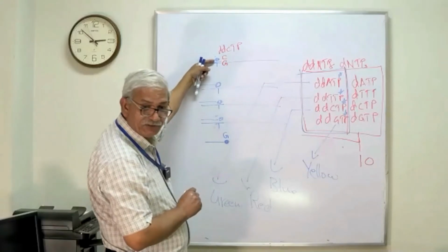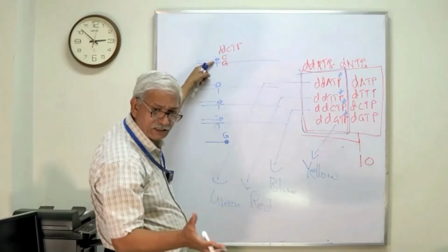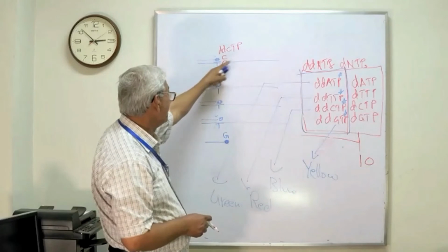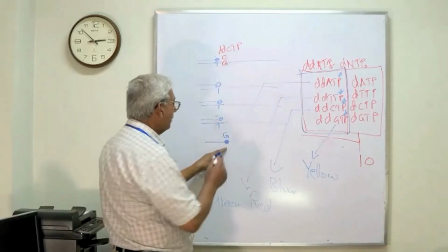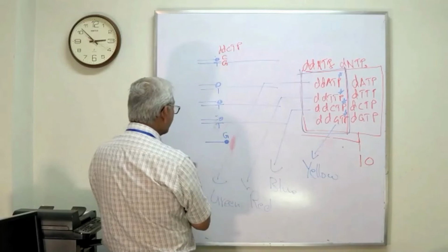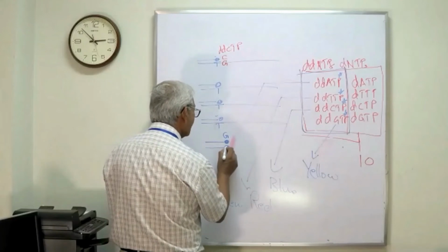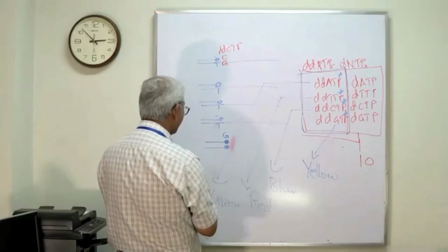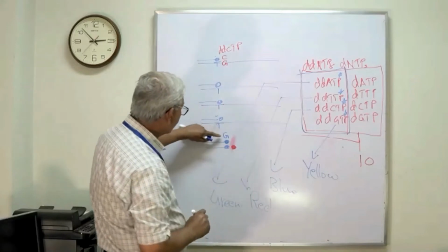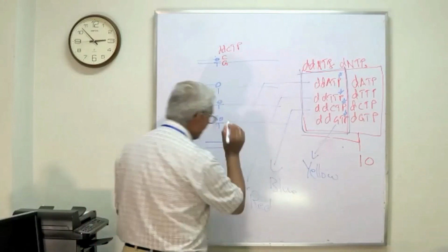Because here there was no dideoxy nucleotide addition at the first position, so that chain is not having any color for A. The color will come only when a dideoxy is added. So dideoxy CTP addition is going to give a blue color to the chain. It means that the second fragment that we obtain in a DNA sequencing reaction is having this nucleotide plus another nucleotide. This fragment is ending at green color, and this fragment is ending at blue color.